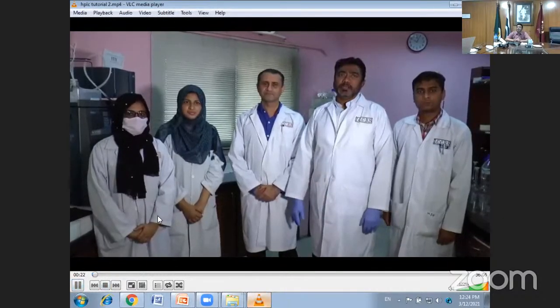This is analytical testing of HPLC. So my aim is for you to learn analytical HPLC. The practical demonstration you already saw yesterday, but today is more practical.